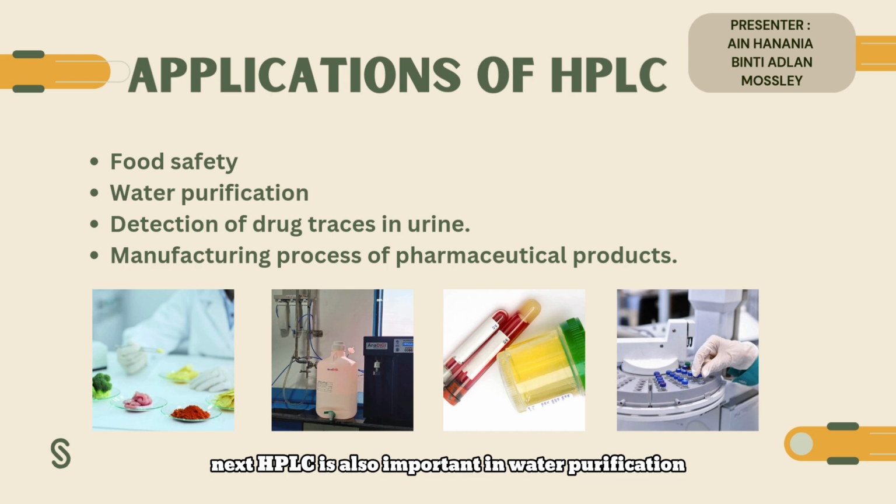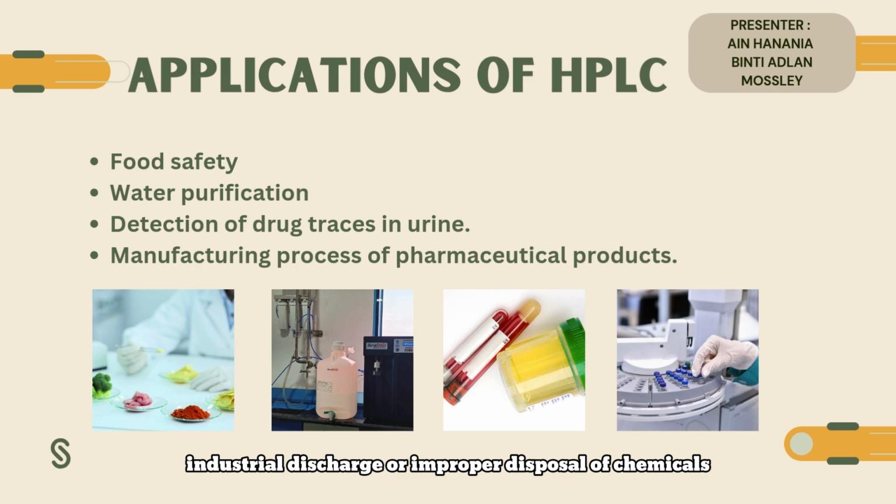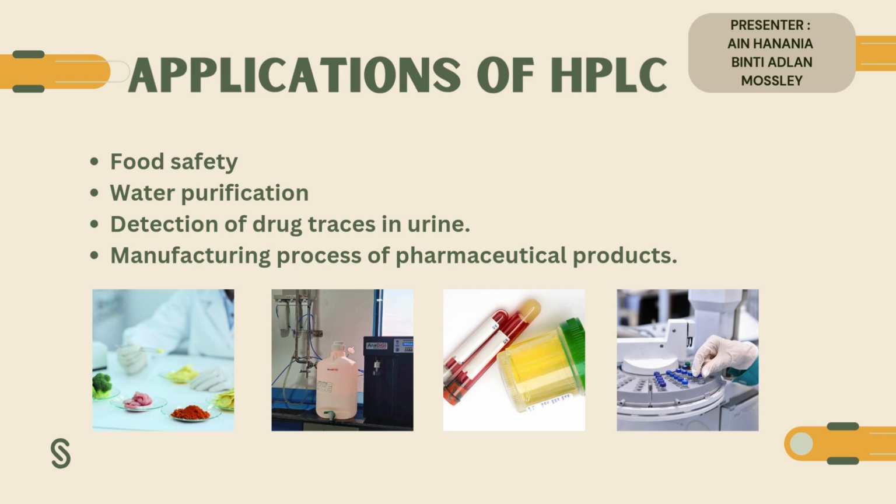Next, HPLC is also important in water purification. It is highly effective in detecting organic contaminants in water, including pesticides, herbicides, industrial chemicals, and pharmaceuticals. These substances may be introduced into water through agricultural runoff, industrial discharge, or improper disposal of chemicals.